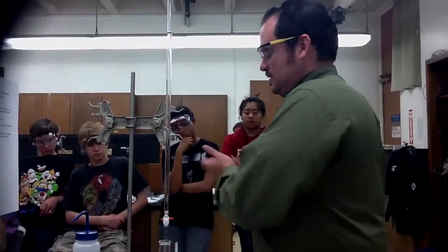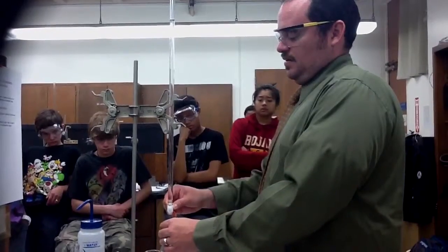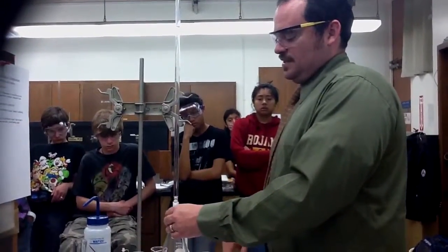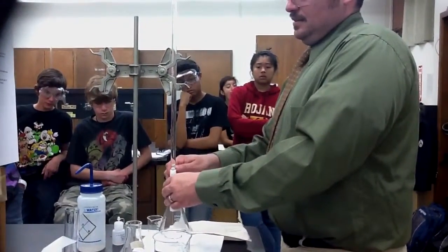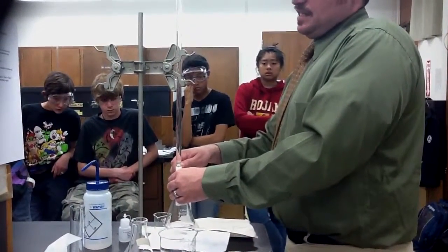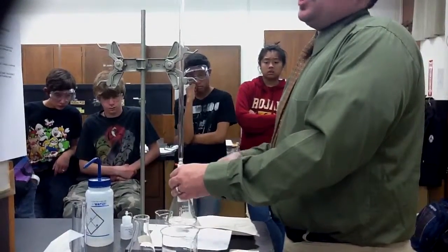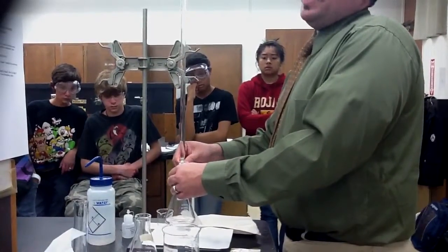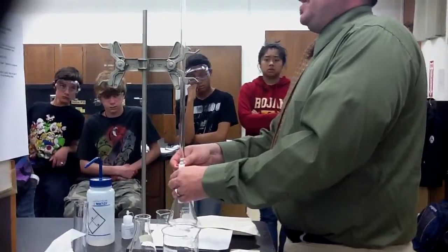Alright, so let's start doing this. What I'm going to do is open the stopcock here and start adding the base. Some of you will see that as the stream hits the acid solution, it's already turning pink. The stream is going to be pink because that's all sodium hydroxide, very concentrated, so of course it's going to make the phenolphthalein pink. That's how you know at least you have added the indicator drops. If you don't see any pink, you should stop and add the drops.